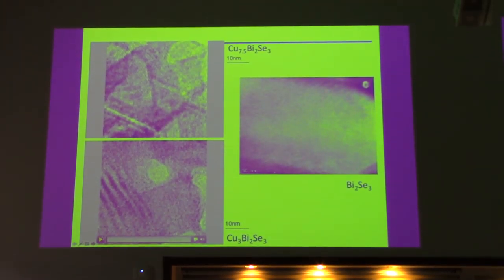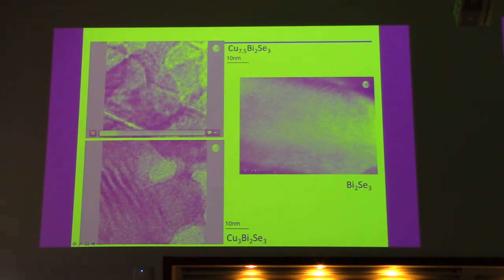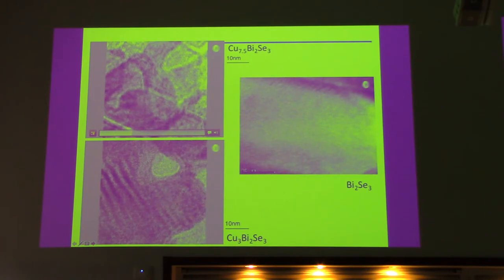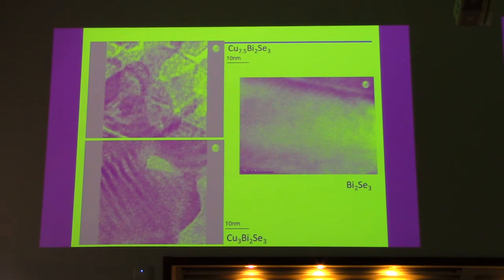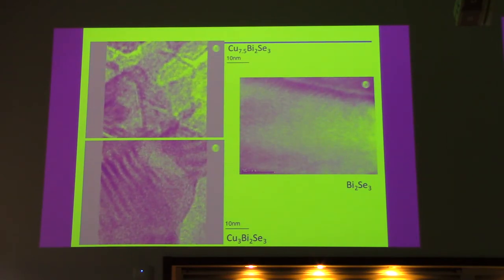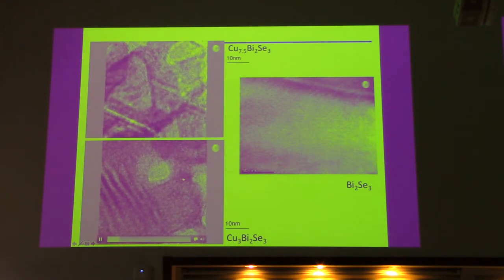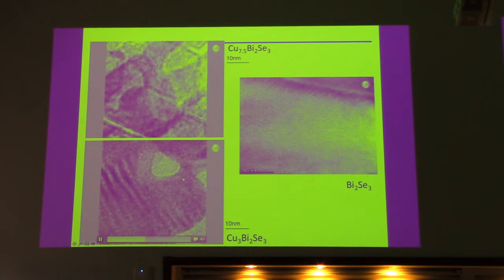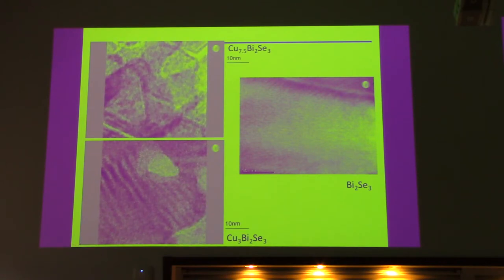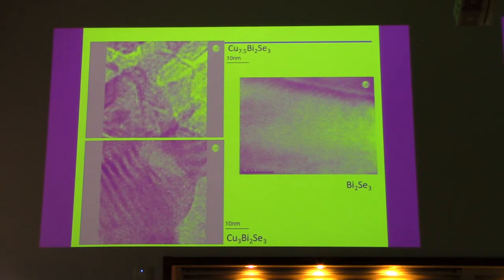Now, this is at room temperature. This is a stripe phase, and this is a hexagon phase. The beam is completely spread in the TEM, so it's as wide as possible. But we have an electric field from the e-beam itself, and that electric field matches that for this copper that's sitting in this host, and we start to get a sliding charge density wave. So here you can see it completely unlocking and sliding around. Supposedly, these should also sing. So at some frequency, they'll actually start to make a sound. They basically sing. So you get singing charge density waves.